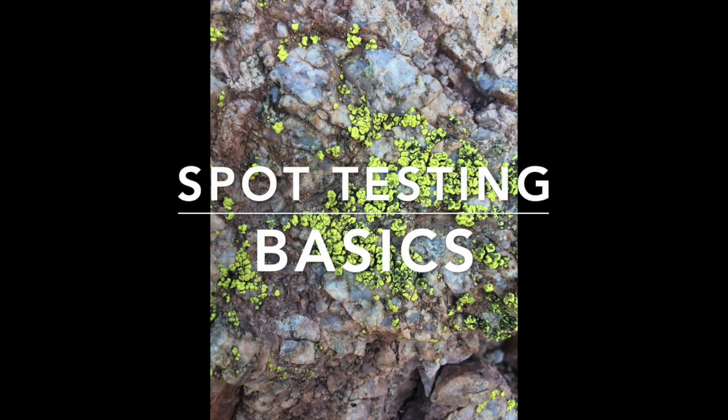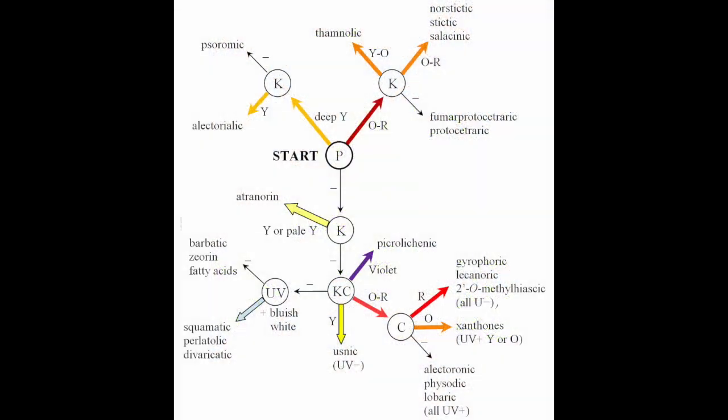Spot testing basics. Spot testing is a necessary part of identifying lichens accurately. It is also fun and easy. In fact, you might find that most of the effort is getting in the habit of using the tests.